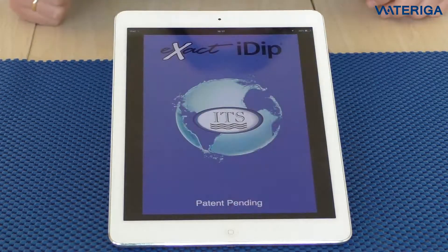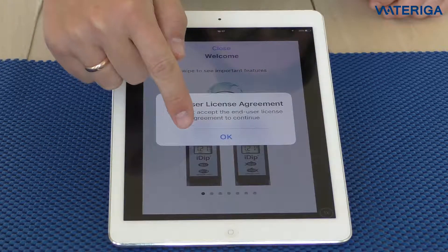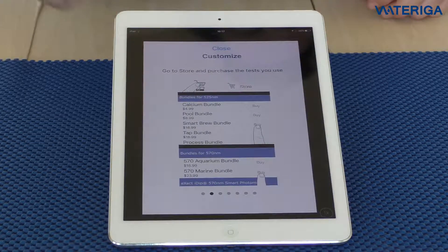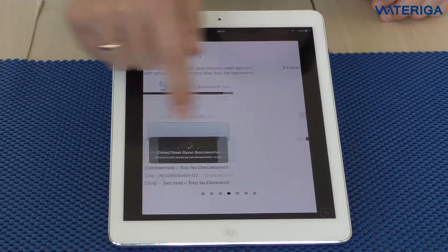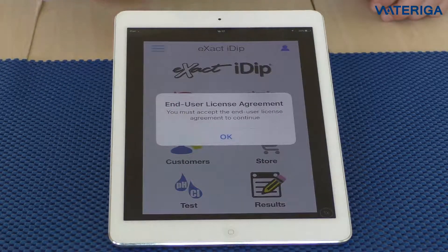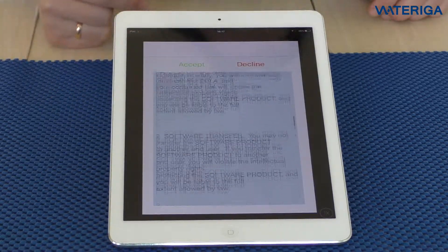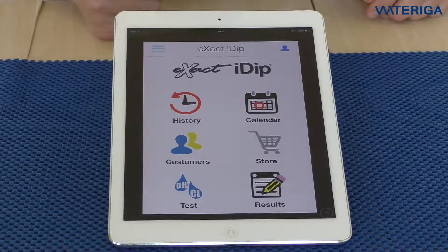Let's hit the i-Dip app. It has a welcome screen where you can scroll and see the different features and how to use the app. When you're happy with that, you can hit close at the top. You will then be shown the Xact i-Dip end user license agreement. Once you've read it, please hit accept if you're ready to start using the app.